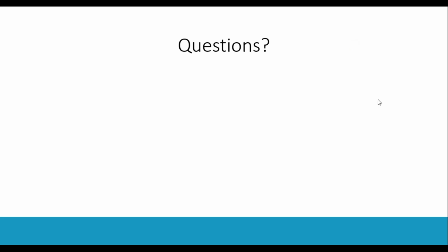Thank you. We have a question here from Ji Chen, and they ask, how many humidity points are needed to enable BET calculation?